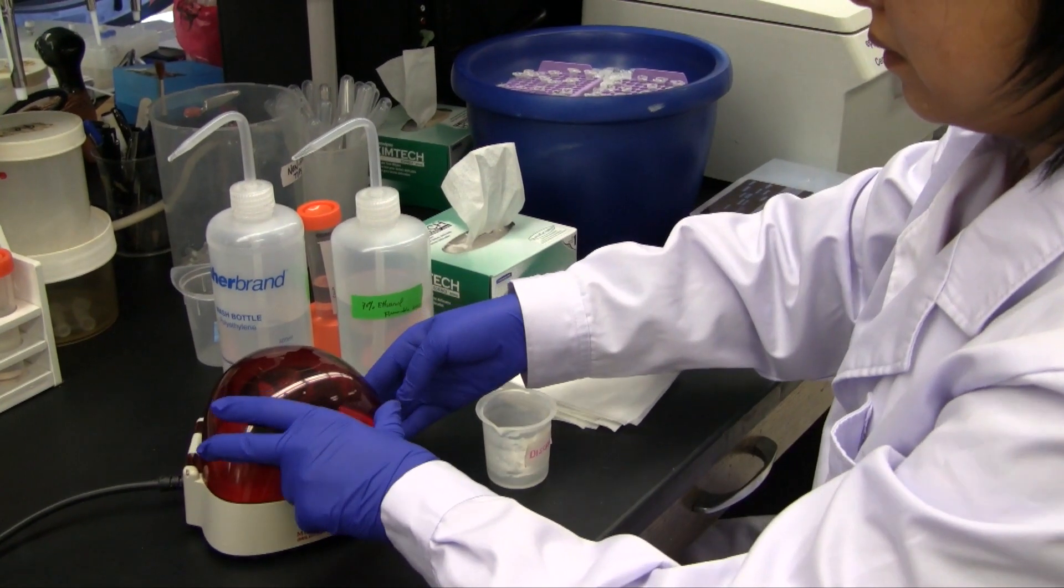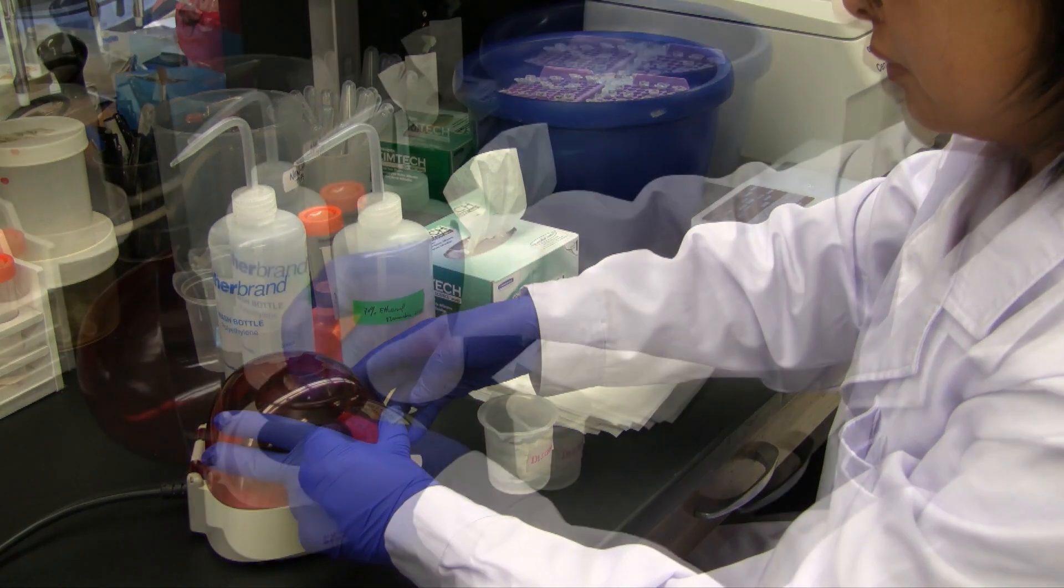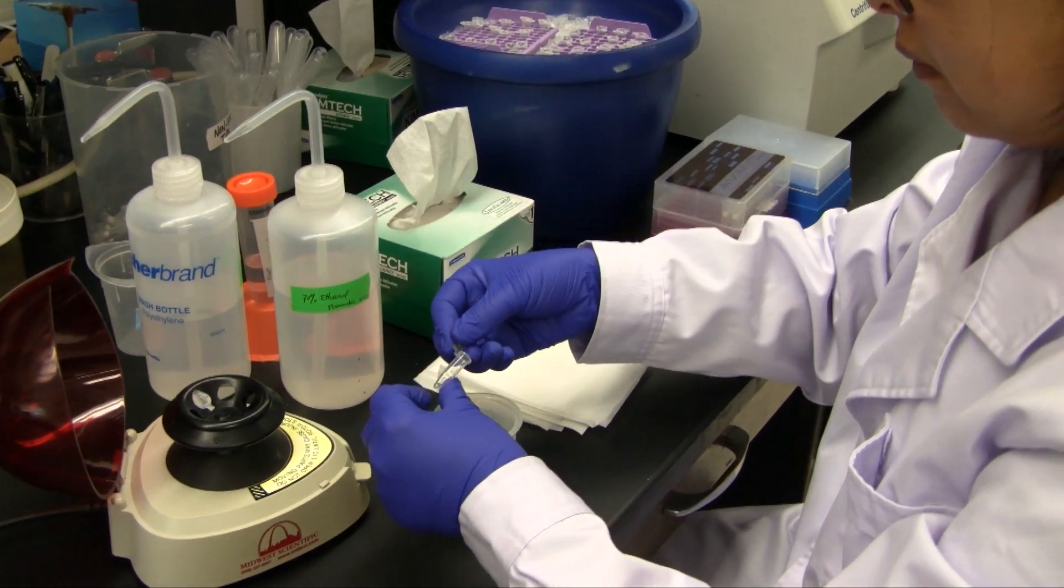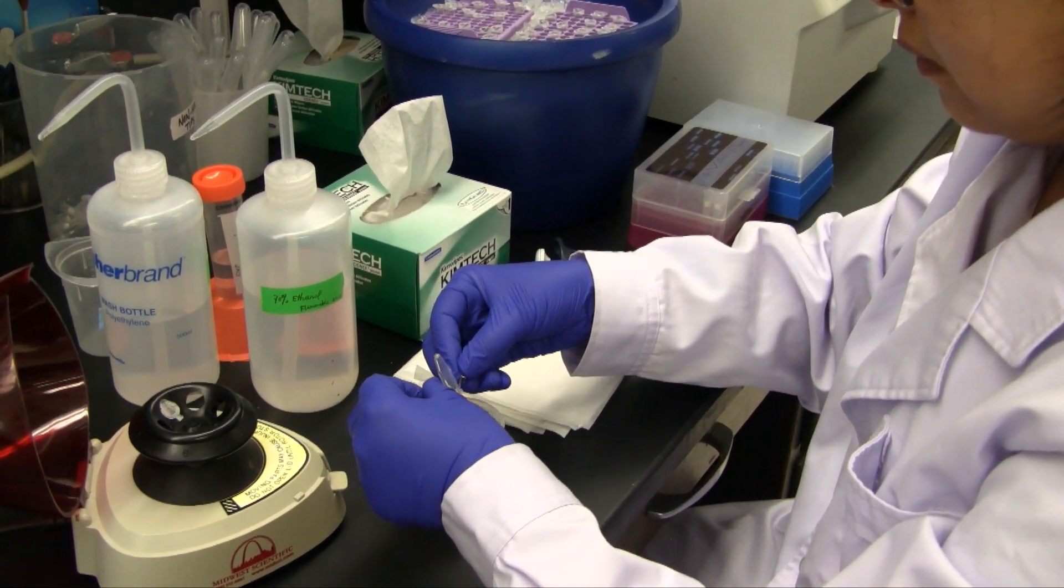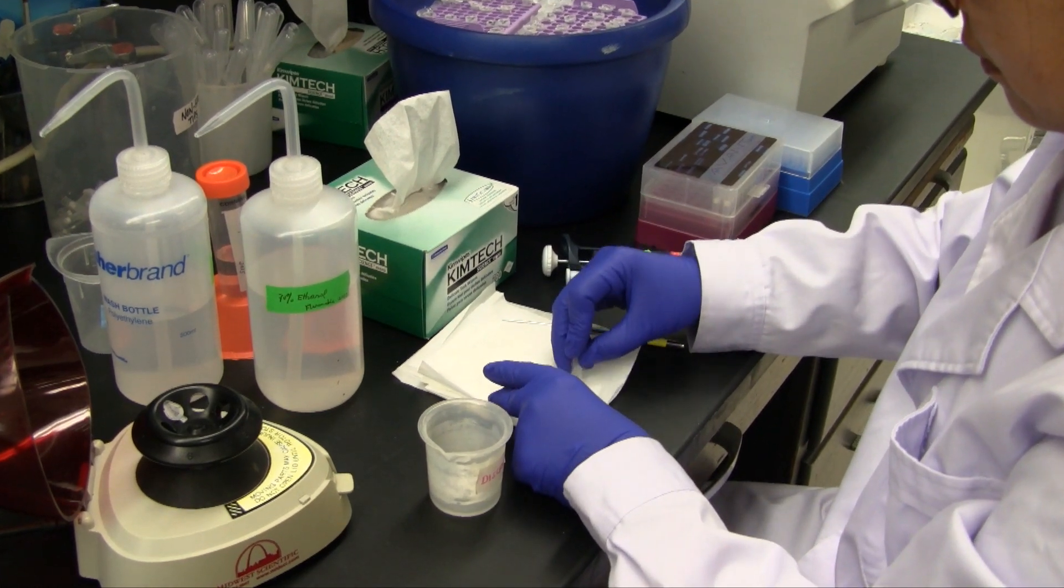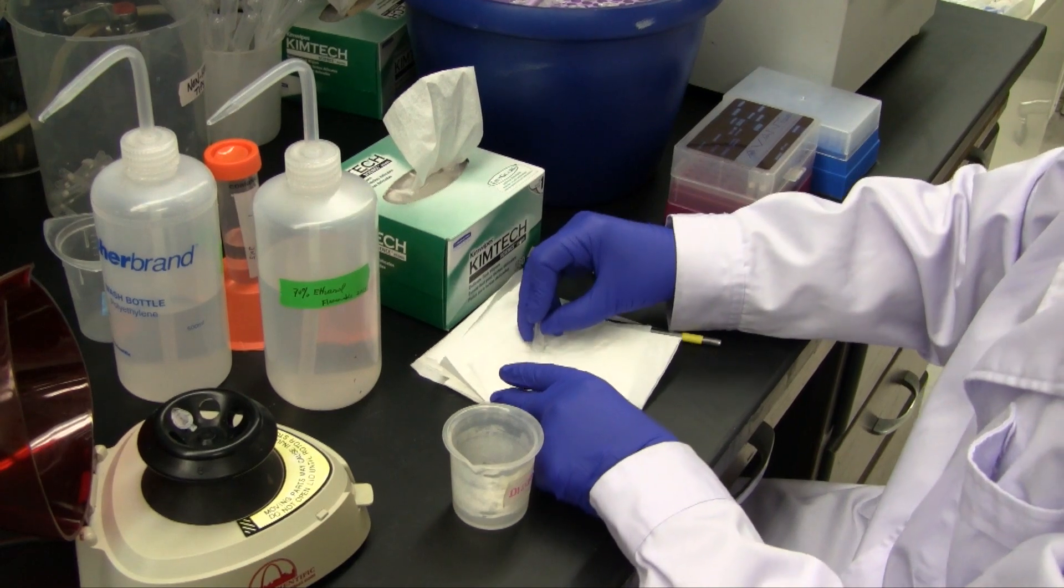The tubes are then centrifuged at 2000 RPM to pellet the cells. After centrifugation, the ethanol is poured off carefully. Excess fluid is removed by blotting the rim. If desired, the remaining ethanol may be removed with a non-filtered pipette tip.